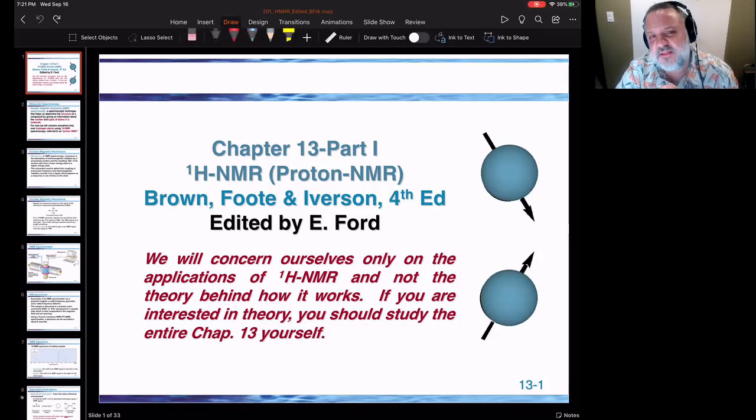However, carbon-13 does, and there's an appreciable amount of that isotope that we can still gain some information from just any random sample, because any random sample will have enough carbon-13 to develop a signal. But we're specifically talking about nuclear magnetic resonance spectroscopy, that's what NMR stands for, of protons, of hydrogens. We can do carbons, phosphorus, nitrogen, other atoms, but we're going to focus on proton NMR in this video.